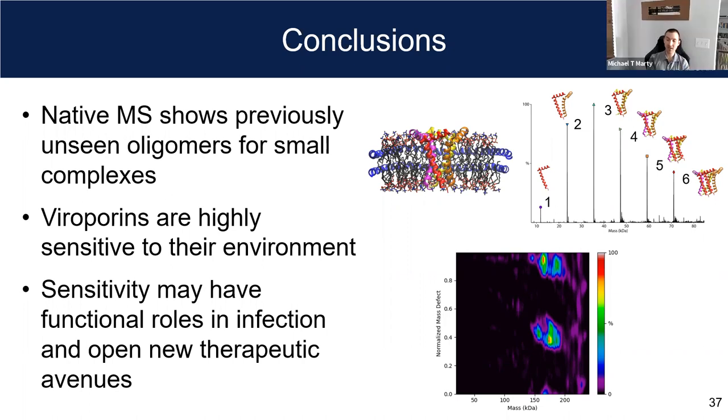So things like, we did some size exclusion chromatography to validate this. And we do see that in the conditions where it's more polydispersed, we get a broader SEC peak. In the conditions where it's more monodispersed, it's a much tighter SEC peak. It's hard to compare though, because the micelle size will really dominate exactly where it comes out.